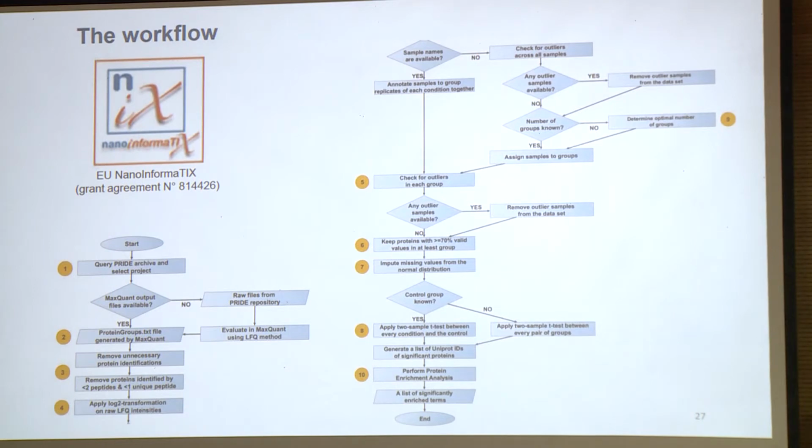This is the full workflow. So all the parts are here. And this is part of the nanoinformatics project. This is an EU project, and it's about making models to assess nanomaterial safety. It has a platform where all these models will be available. That's why this workflow will be part of the platform, and we will also upload it probably in January. If you would like to have it, of course, you can contact me and I can give it to you.